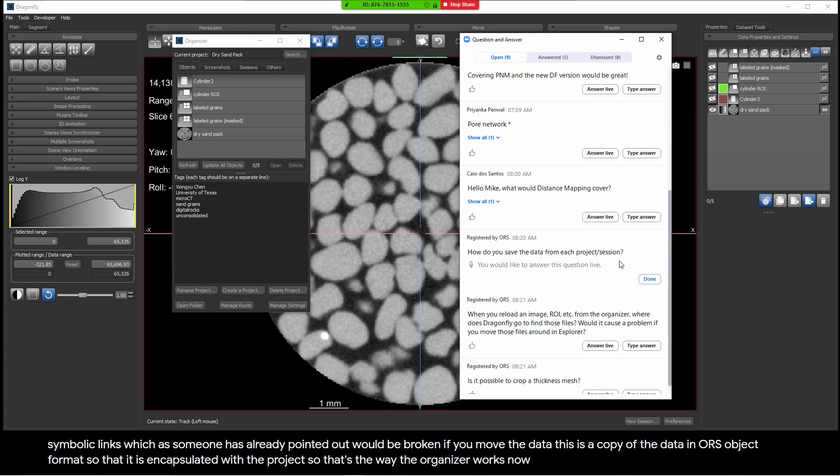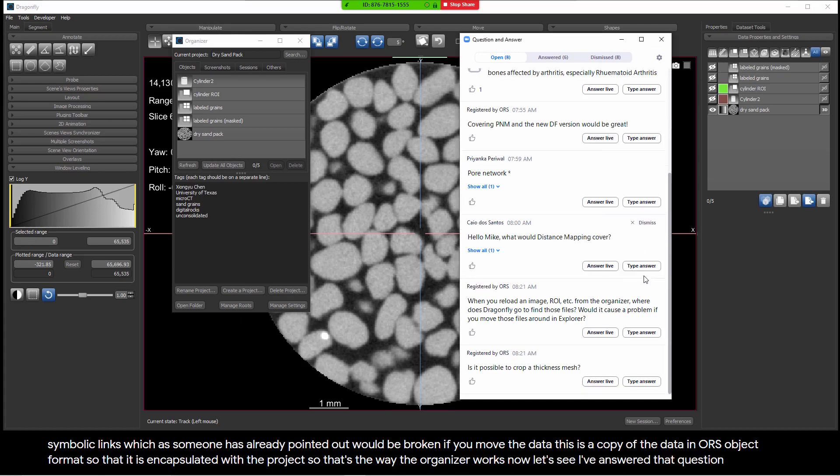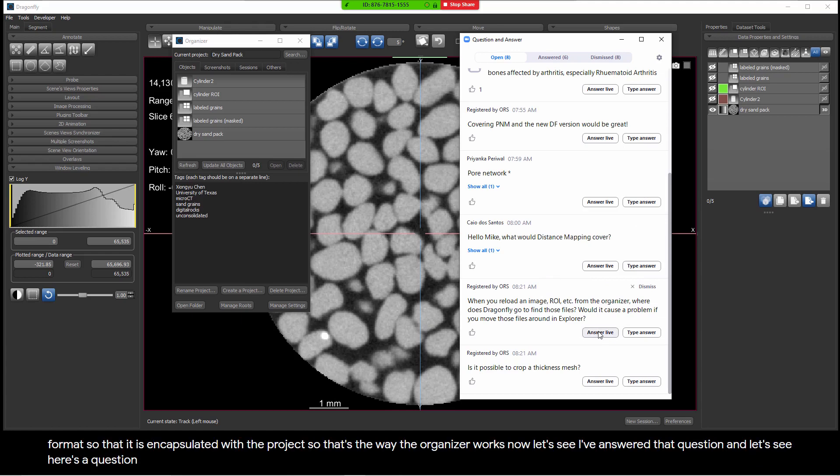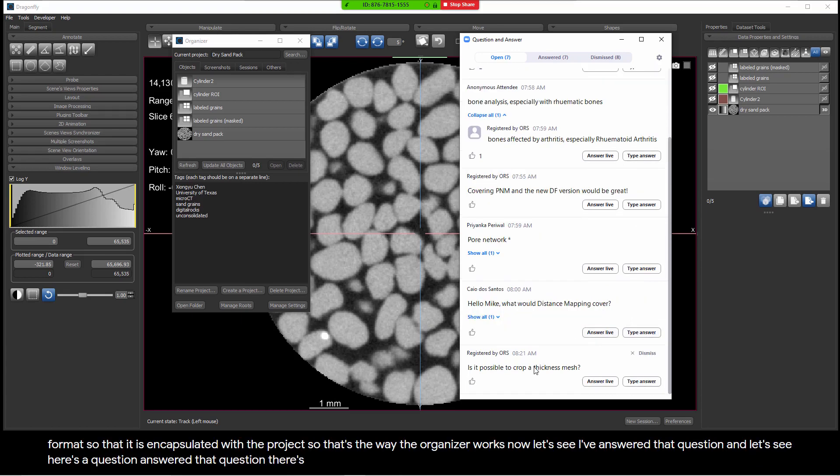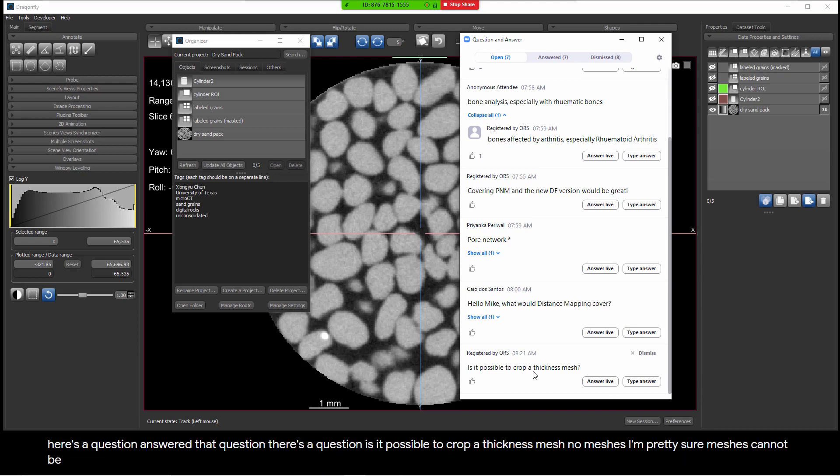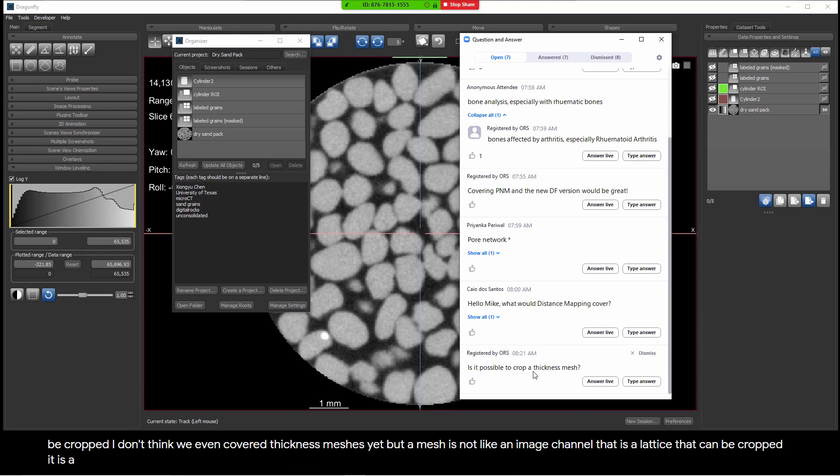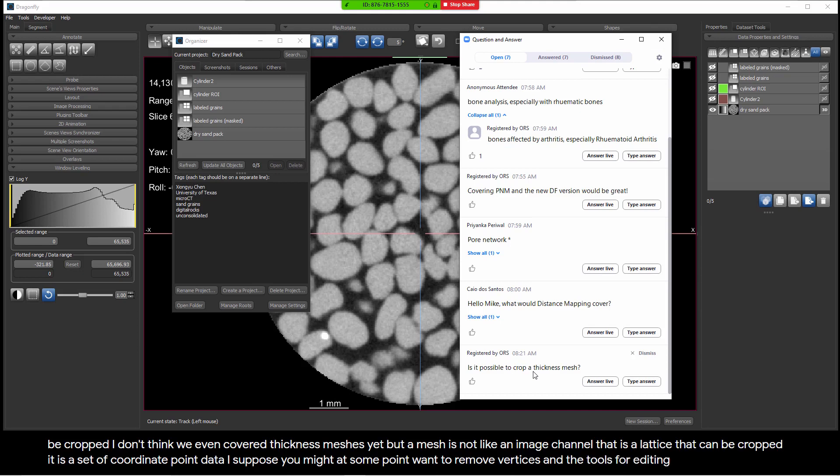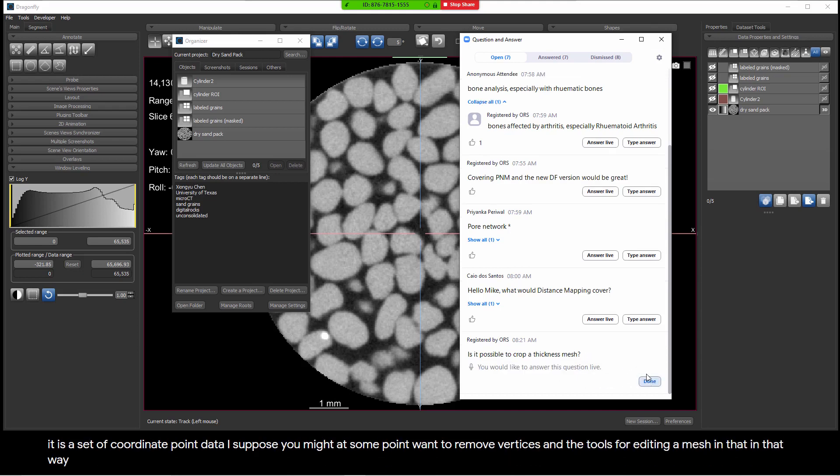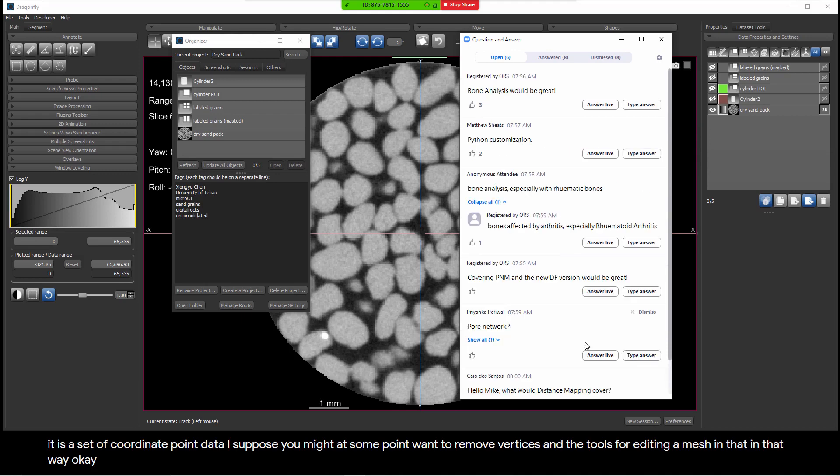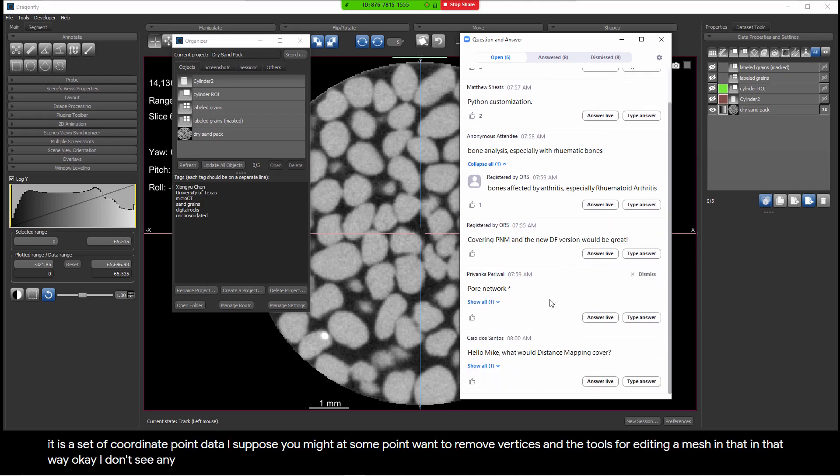Here's a question. Is it possible to crop a thickness mesh? No, meshes, I'm pretty sure meshes cannot be cropped. I don't think we even covered thickness meshes yet, but a mesh is not like an image channel that is a lattice that can be cropped. It is a set of coordinate point data. I suppose you might, at some point, want to remove vertices and the associated triangles, but I don't think we have any tools for editing a mesh in that way.